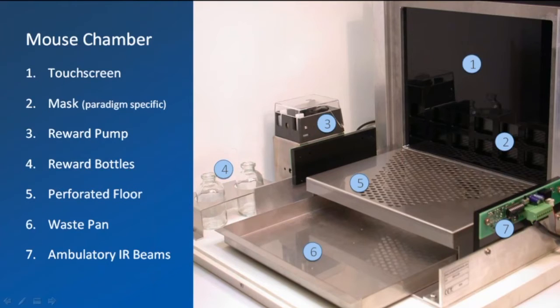Julie will show some pictures that will reference this or show the animal rearing up to respond, and that is strictly unique to the rat chambers. This rearing component was found to help reduce the impulsivity of the rat's response and overall help their accuracy. Lastly, we see the views of the floor, waste pan, and again the infrared beams.